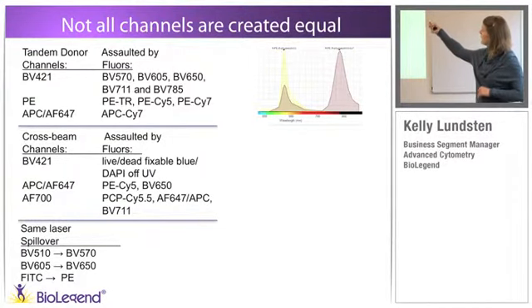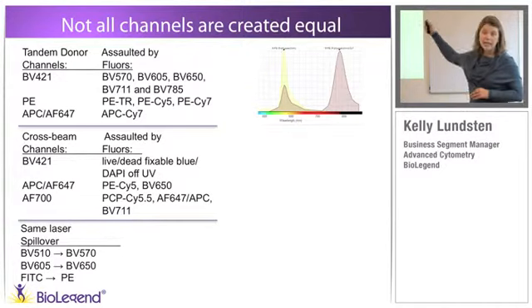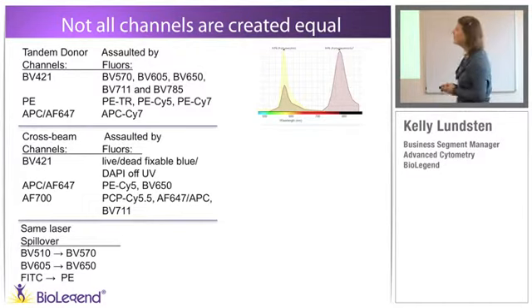So for here, the spectra that we're looking at in yellow here is the emission of PE. The one in kind of purple-pink here is PE Cy7. So you can see how much emission coming from the PE Cy7 is actually emitting back into PE. Well, PE has 3 tandems that could seriously screw up the background or contribute quite a lot of background into that channel. That would be very much unwanted. So even though PE is very bright, my signal to noise is being affected.